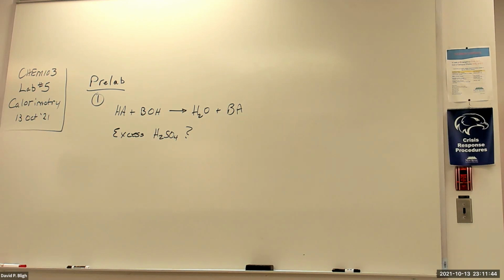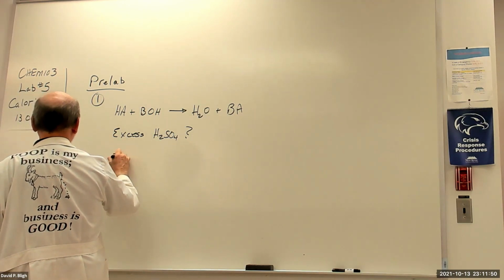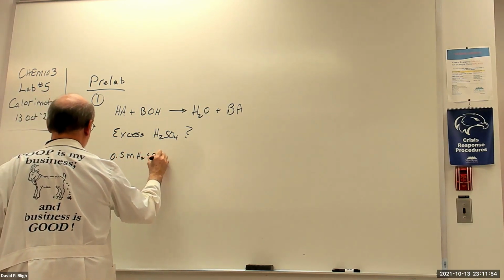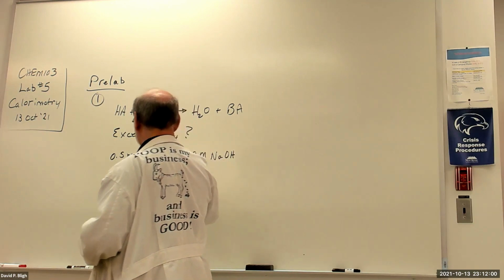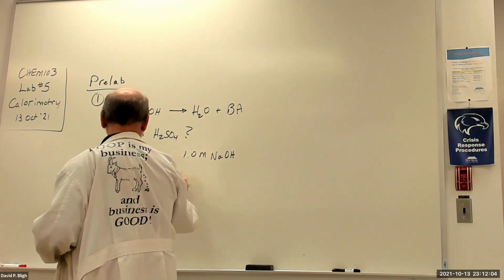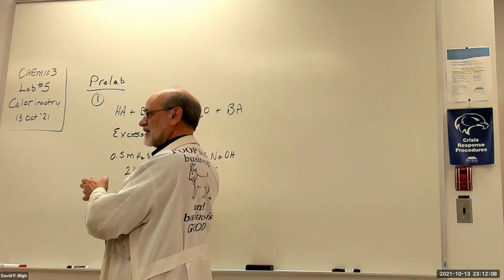Is it like concentrate? No, actually, we're adding 0.5 molar H2SO4 and 1 molar sodium hydroxide. So that imbalance is taken into account, where this one has 2 protons produced and this one only has 1 hydroxyl. So that's not the answer.